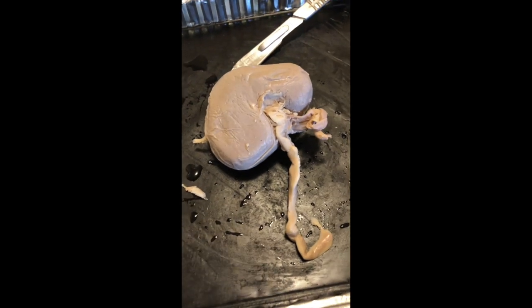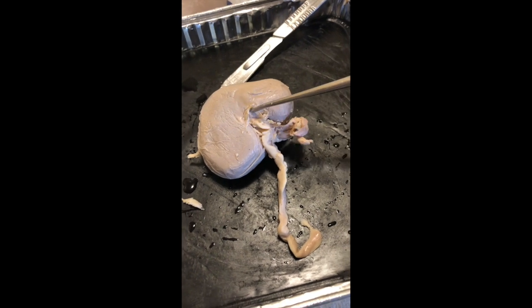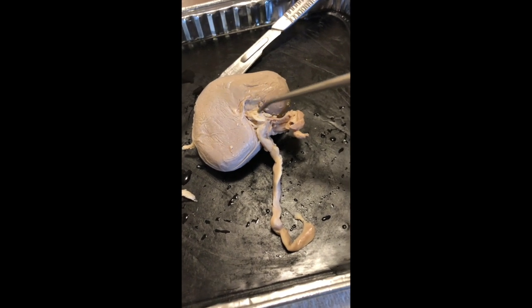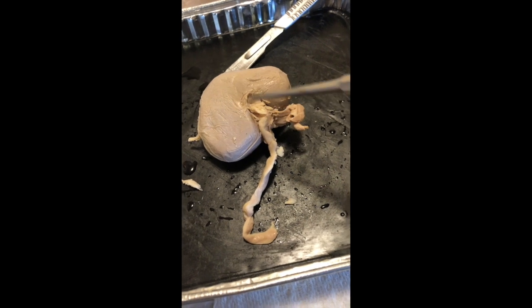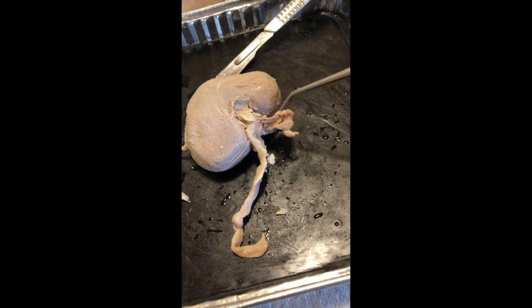So here's the kidney I have for this dissection. It hasn't been cut yet. So here, this little area where all these things are connecting is the hilus. Then this here, branching off, is the ureter, which takes the urine into the bladder. And then this would be the renal artery and renal vein.